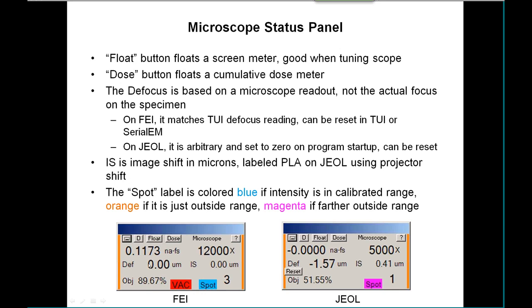On an FEI scope, this defocus readout is always going to match the reading that's in the microscope interface. You can reset it either in the microscope interface or in SerialEM. On the JEOL, it's arbitrary because it just gets set to zero on program startup. You can reset it using the little button we've put here for convenience.